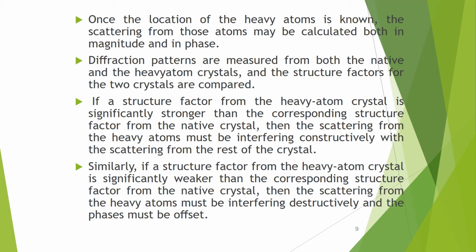Similarly, if a structure factor from the heavy atom crystal is significantly weaker than the corresponding structure factor from the native crystal, then the scattering from the heavy atom must be interfering destructively and the phase must be offset.